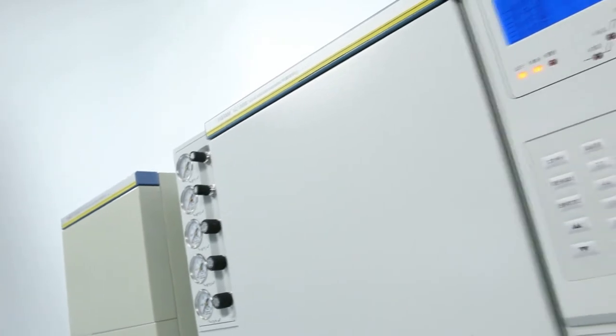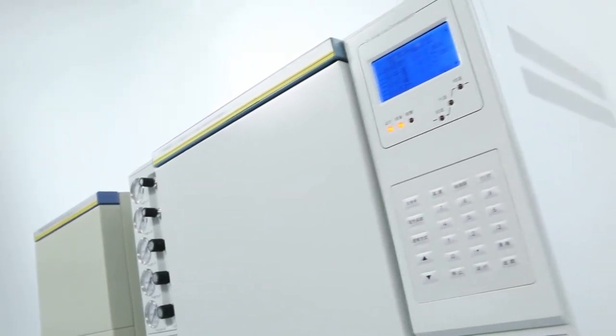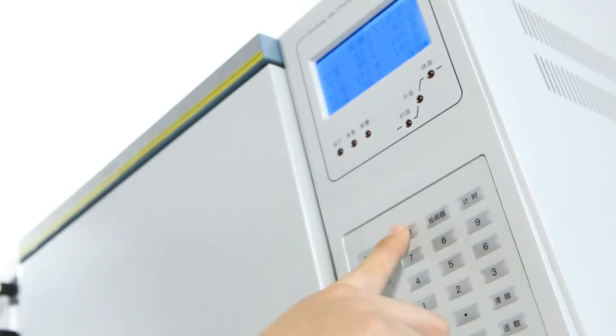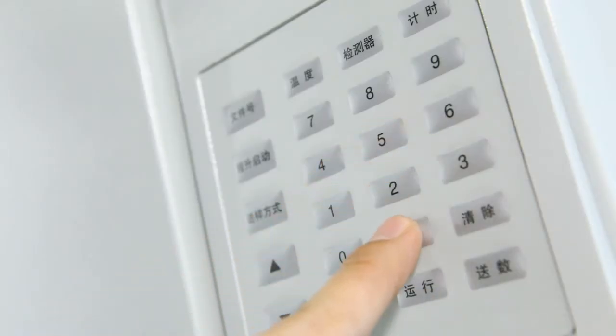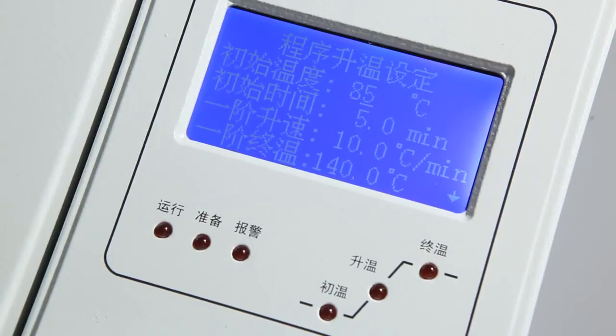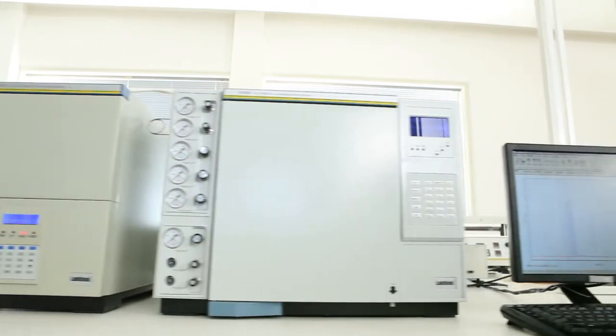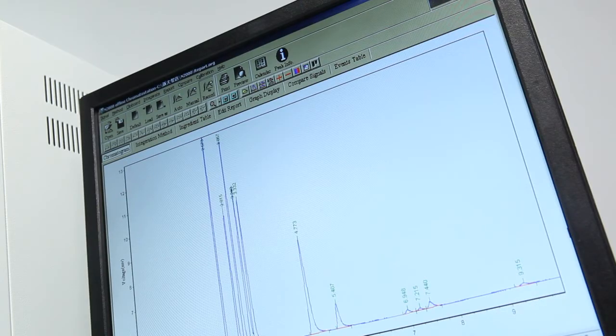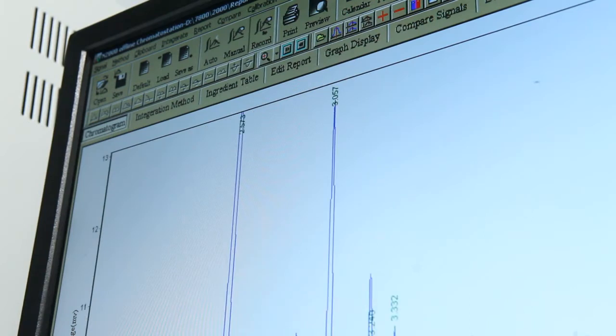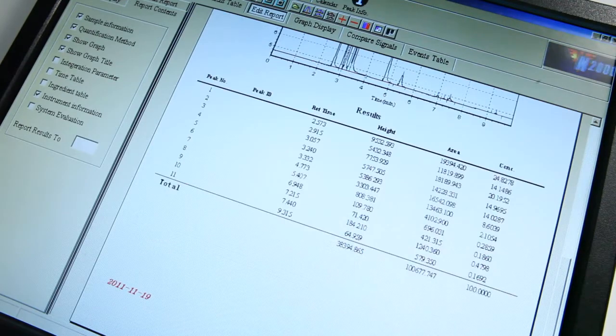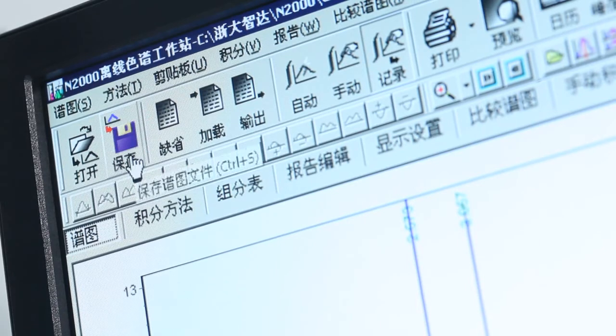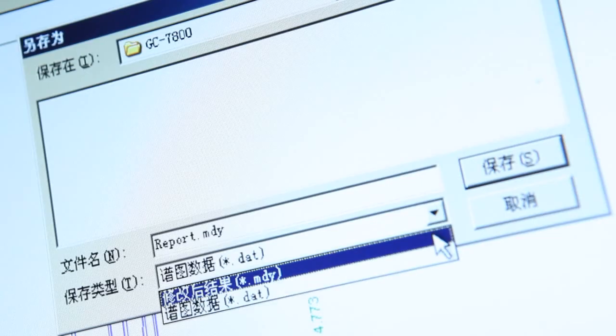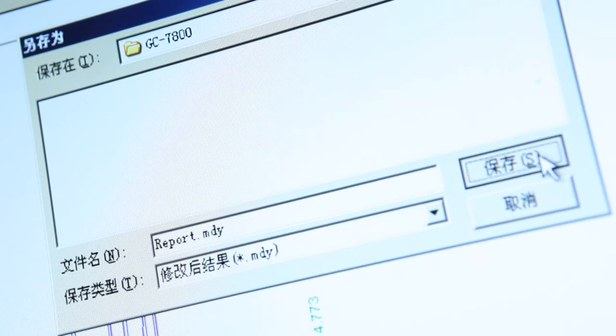The GC7800 adopts isothermal and multi-step temperature program analyzing methods, which can greatly improve the sample analyzing accuracy, the testing efficiency, and the operational convenience. The professional gas chromatography software equipped with this instrument provides powerful data reanalysis and reprocessing function. The multi-format report exporting function makes the sharing of test data easier and more convenient.